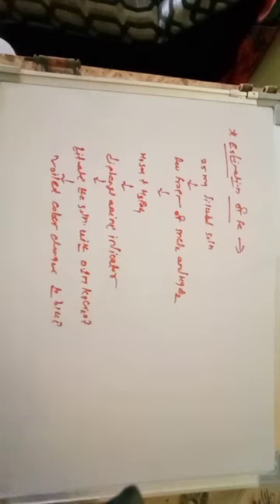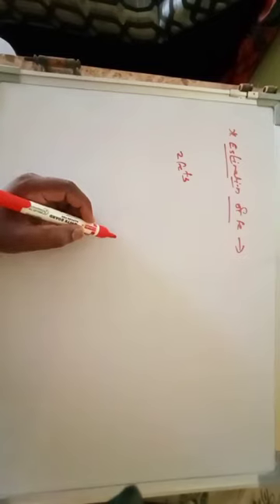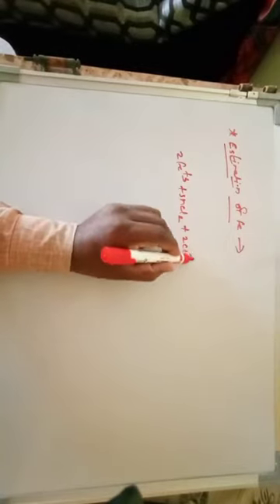blue. So what is the use of this tin chloride? I already told that this tin chloride is your reducing agent. This Fe is present in the +3 oxidation state, so it will interact with SnCl2. The Fe is already dissolved in acid; if you see the dissolution process, it is already dissolved in acid, so it forms the iron chloride complex, the chloro complex.